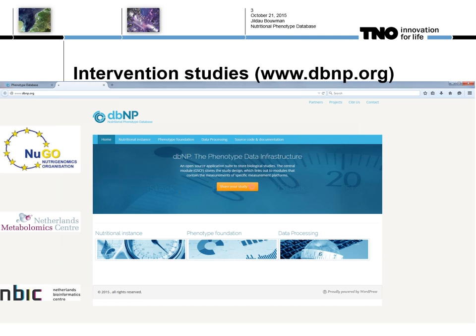I would like to show you today something about a phenotype database and how we use the phenotype database to store nutritional studies.